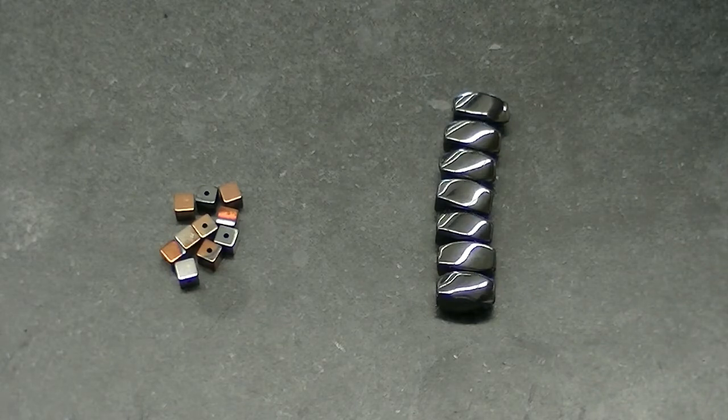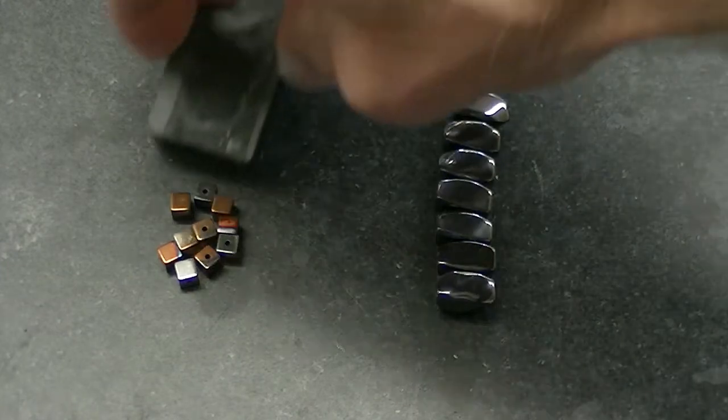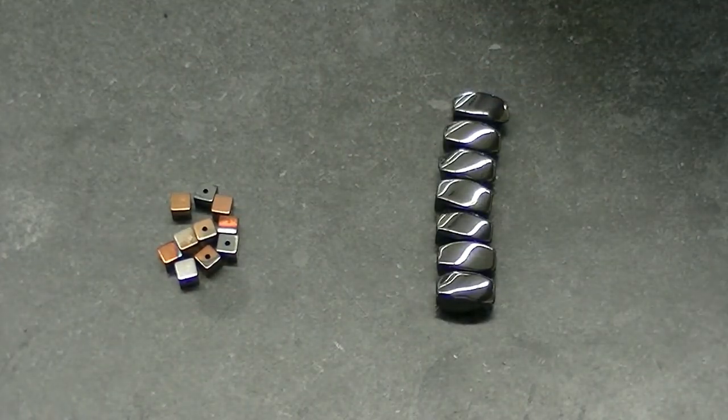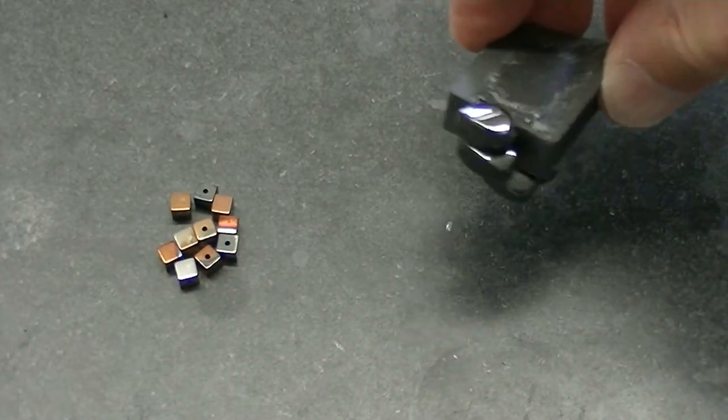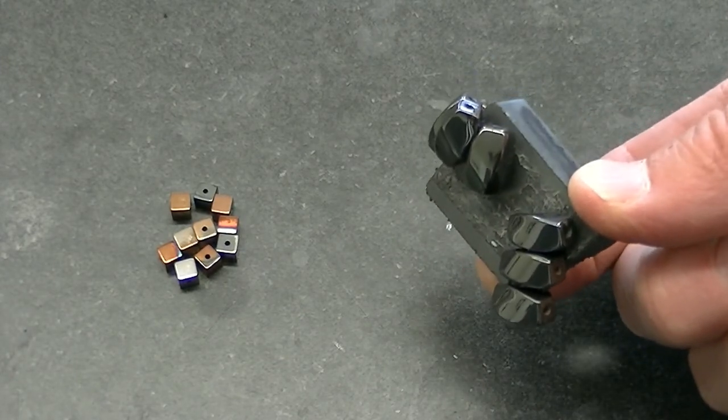So there you have it. It looks like the beads that are sold as hematite stone do show some evidence of containing hematite, whereas the beads that are sold as magnetic hematite don't show much evidence of containing the mineral hematite.